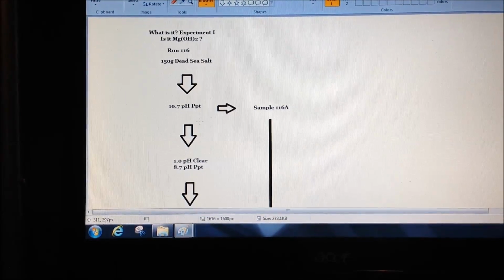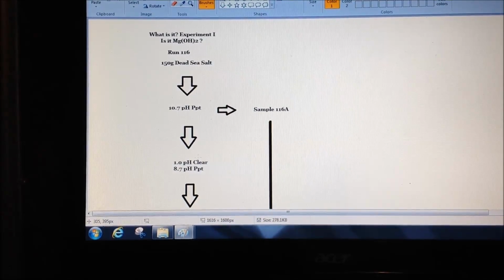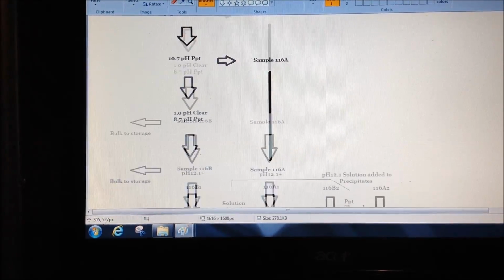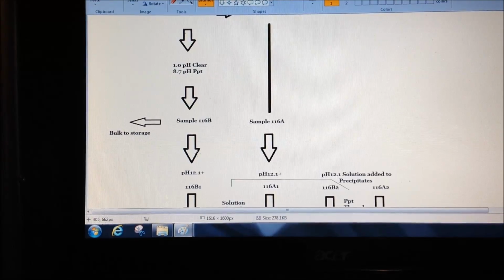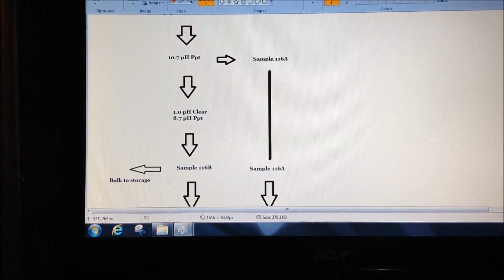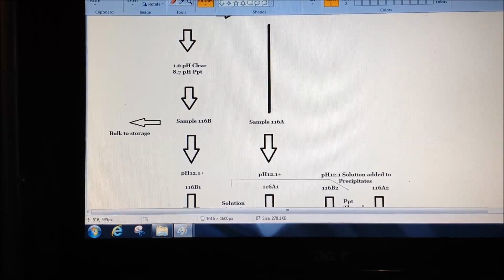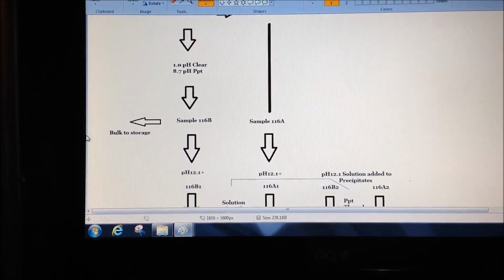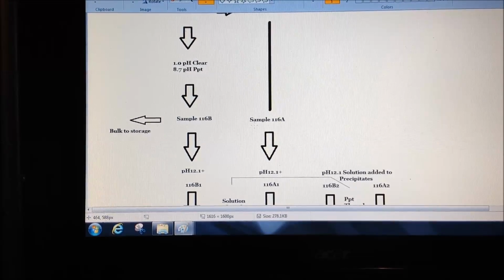and then proceed to reduce the wash and then reduce the precipitate pH to 1, whereupon it clears, and then back up to 8.7 slowly to produce the second stage precipitate, which is the normal Ormus that people would take. And so bringing sample 116A, which is the sample of the first stage precipitate, bringing it down, we're taking a sample of the second stage precipitate as well. And the rest of the precipitate will go into bulk storage as normal, and we'll proceed with the two samples.